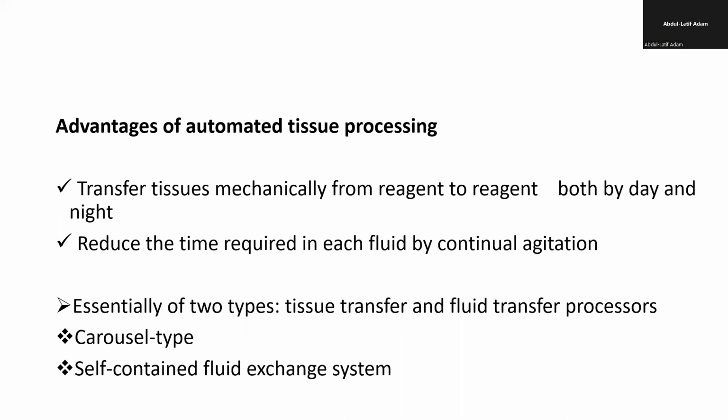You can do both day and night. So tissue processing, you can process several rounds during the day, especially if you have tiny biopsies. It also allows you to process different processing times. Okay, so you can have and those.